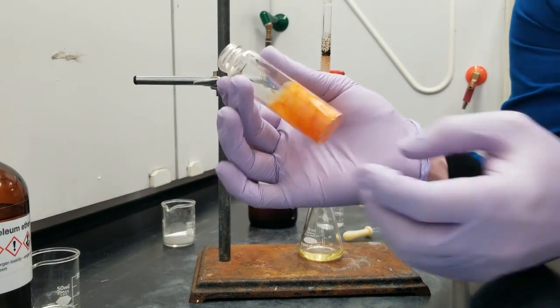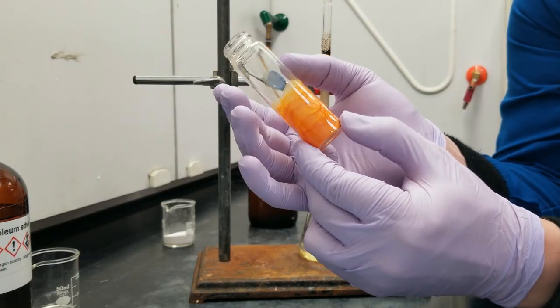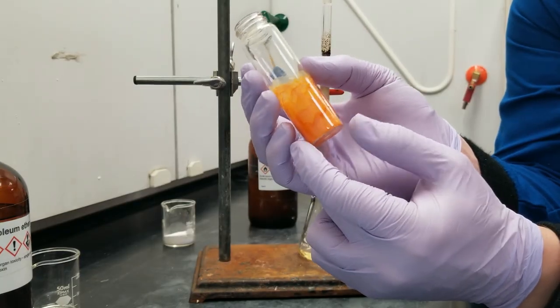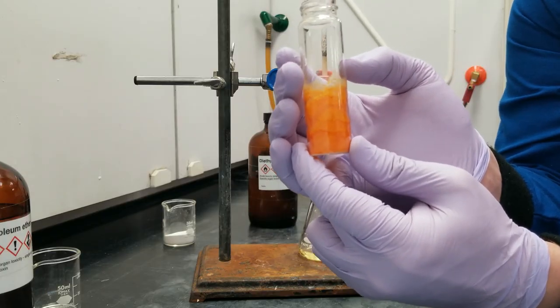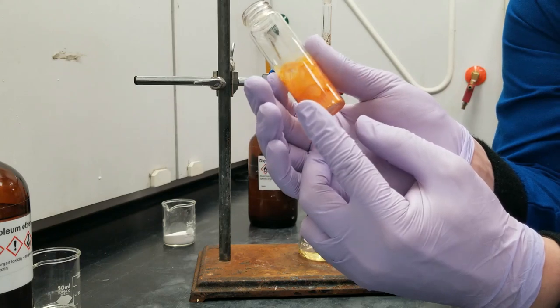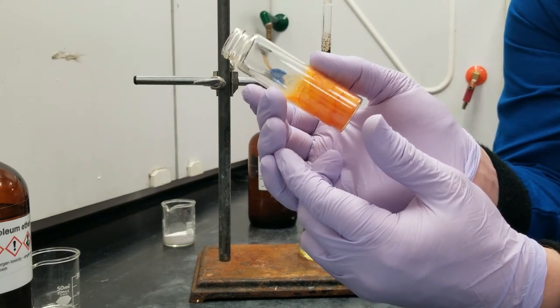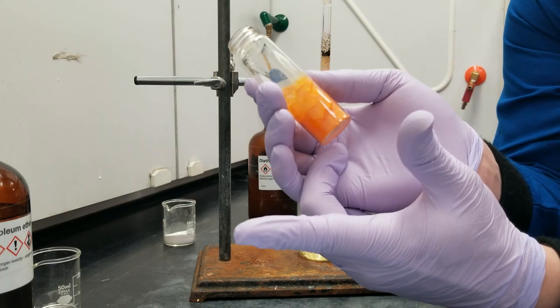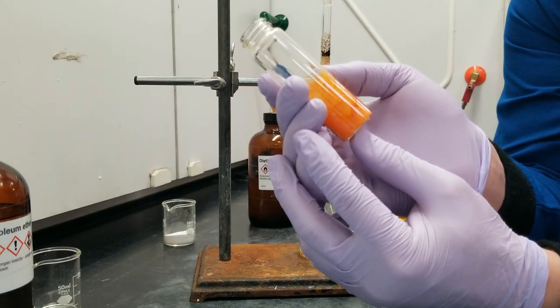This is what my dried product looks like. It's kind of cool and wavy looking. But you can see it still has that dark orange color that we would expect of acetylferrocene. I'm going to collect this just by scraping it off of the sides of this container. I also weighed this container earlier so that I could get a mass of the container plus the solid. That's the easiest way to find a really accurate mass of what I received.